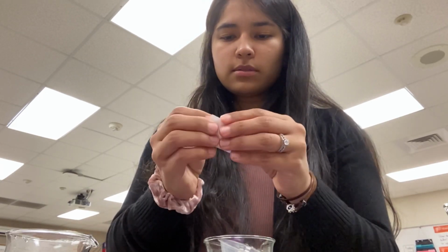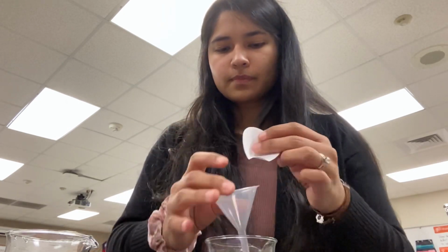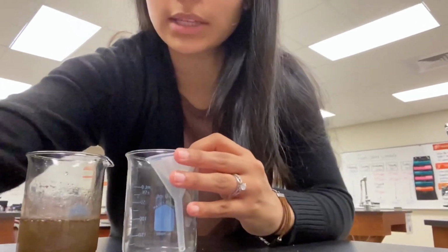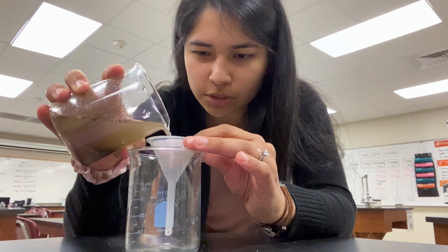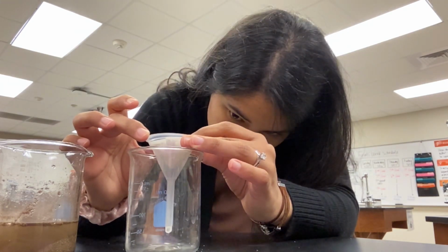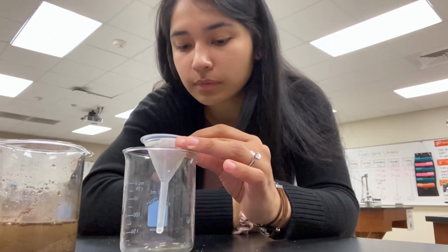So I'm going to fold this, as I had explained in the other video that I made, and place it in my funnel. Place in one more fold. Place it in here. Then I'm going to start filtrating. This will probably take a little while, but it'll work out just fine. Okay, so we're starting to see our filtration. This will take a little while, so I'm just going to fast forward this part.